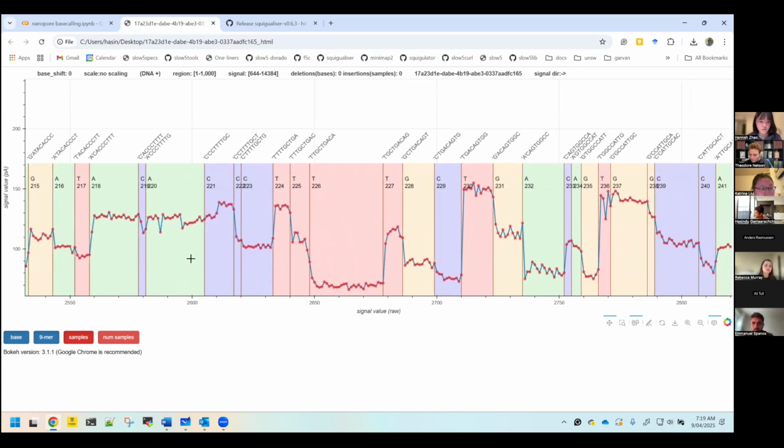I think of an analogy like a leashed dog passing through a gate, okay? You have a leash, like the motor protein, to control its speed, but still you can't 100% control the speed of the dog, right? It can go a bit fast or slowly. So likewise, the DNA strand can also vary its speed, and therefore we have this problem. Yeah. And I even saw in recent papers, sometimes they even go back a bit. Yeah.